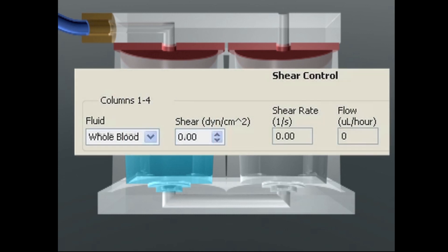A user-defined shear flow is entered into the BioFlux software which creates a precisely regulated air pressure from the BioFlux controller. The controller contains a software controlled pump which distributes pressure to the wells of the BioFlux plate. The air pressure is transferred via the pneumatic tubing to the pressure interface.